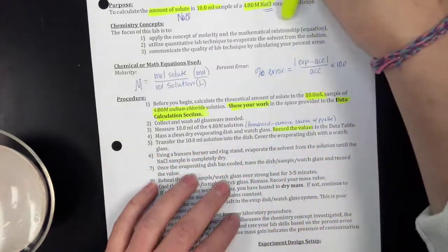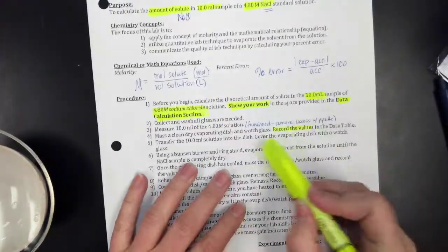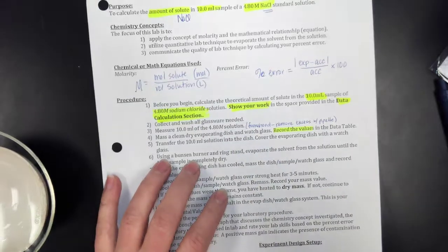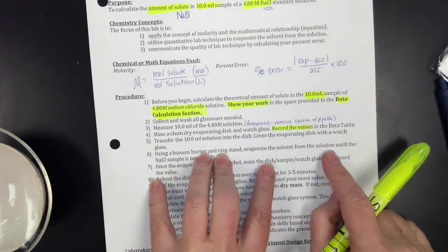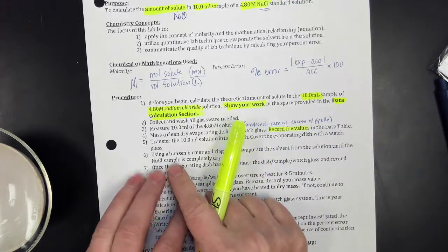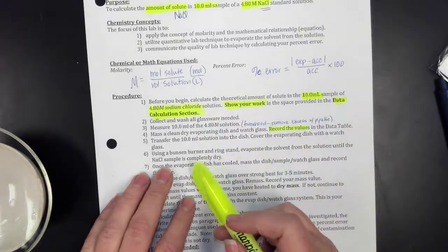Transfer your 10 milliliter solution into your evaporating dish. Cover the evaporating dish with a watch glass. And then using a Bunsen burner and ring stand, evaporate the solvent from the solution until the sodium chloride sample is completely dry. So let's check out your setup.